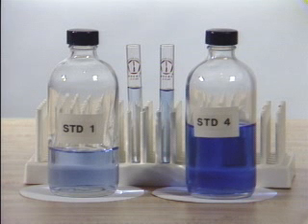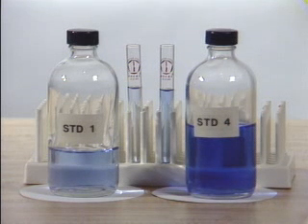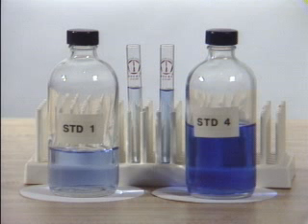Besides the wavelength, two other factors determine the amount of light absorbed by a particular solution. These are the concentration of the solution and the length of the light path through the solution. In this example, one blue copper amine complex solution is more concentrated than the other. Since the tubes are the same width, the length of light path, often called the cell length, is the same.